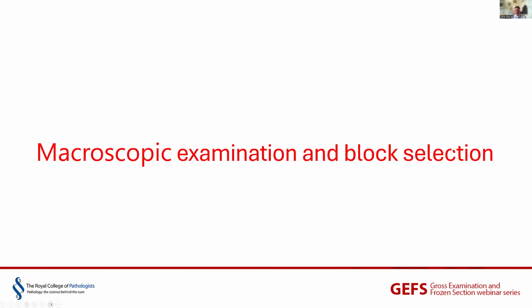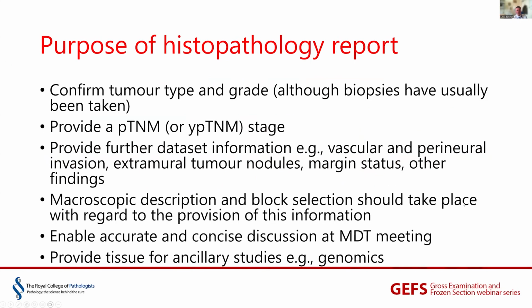Okay, so hopefully we've prepared a specimen and we've orientated it. We've made some assessment of the quality of the surgery. And then how do you take your blocks? When I'm doing this, I always think to myself, well, I need to take blocks that will enable me to fulfill the purpose for which I'm taking them, i.e. the provision of an accurate and succinct histopathology report, which will help to guide patient management.